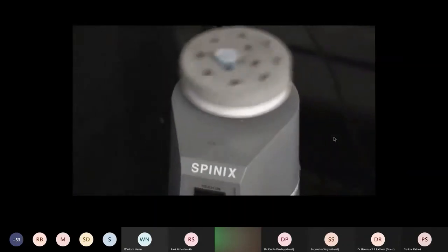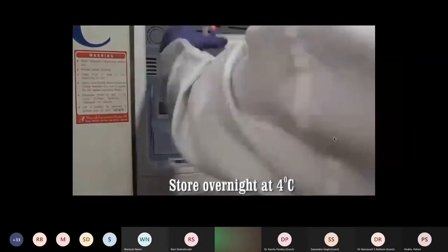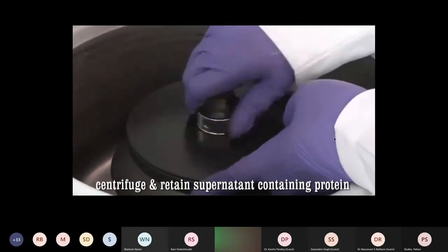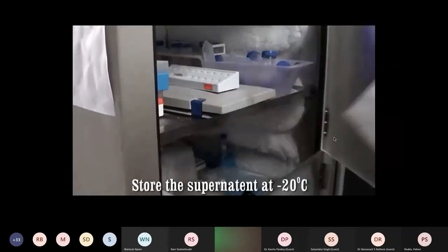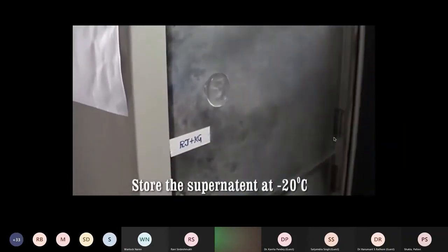Vortex the sample to obtain a uniform solution. Centrifuge the contents the following morning at 10,000 rpm for 5 minutes. Collect the supernatant containing proteins in a fresh tube and store it at -20 degrees Celsius until protein quantification.